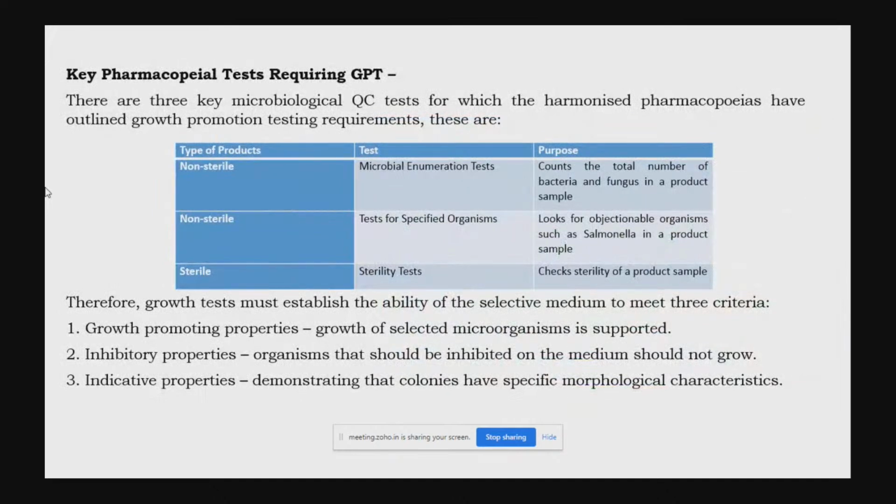Why is it a mandatory requirement? Referring to the pharmacopoeial references like European Pharmacopoeia, Japanese Pharmacopoeia, Indian Pharmacopoeia, or whatever, the microbial limit test for specified organisms and the sterility test are chapters which are harmonized. Harmonization indicates that, considering all the pharmacopoeias, the test procedure is similar. So looking at the requirements of these pharmacopoeias, we need to ensure the growth promotion activity of the media.